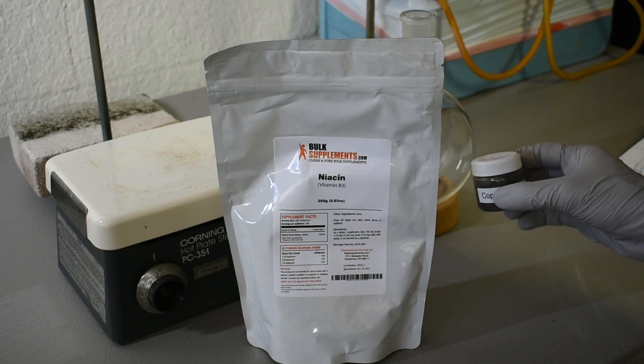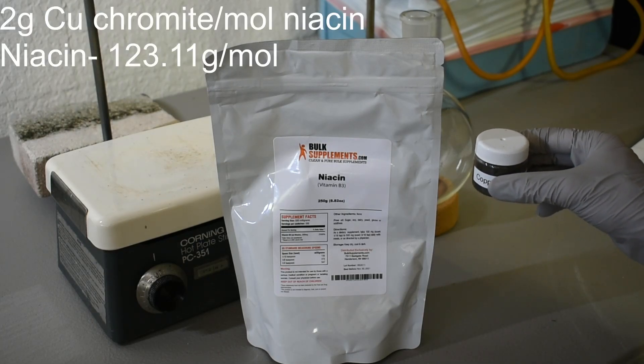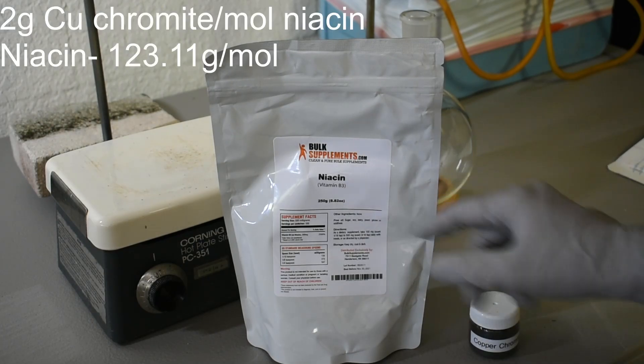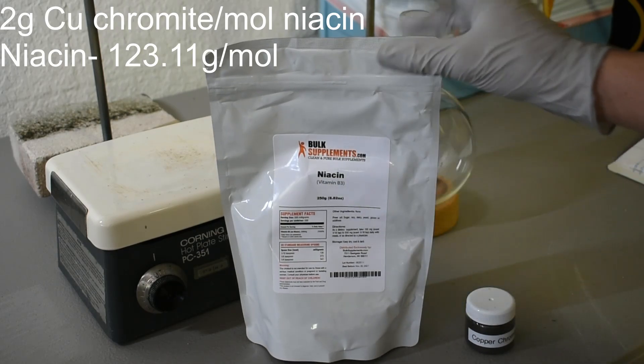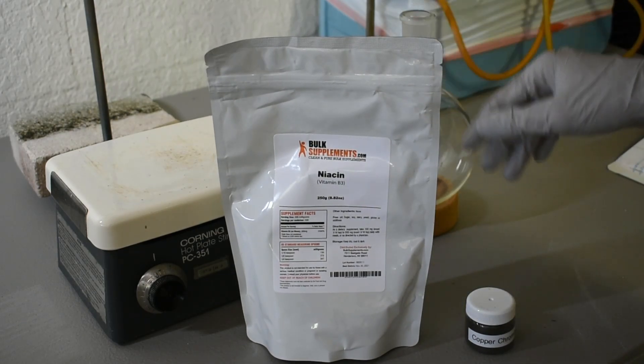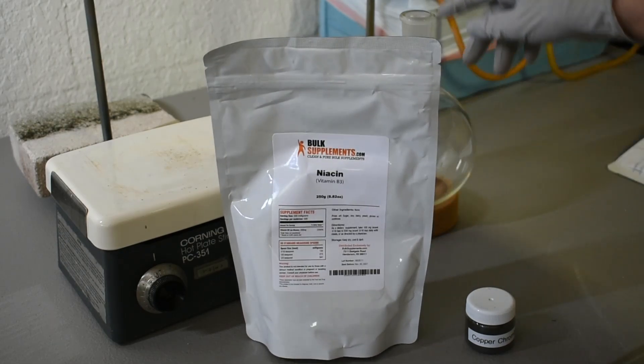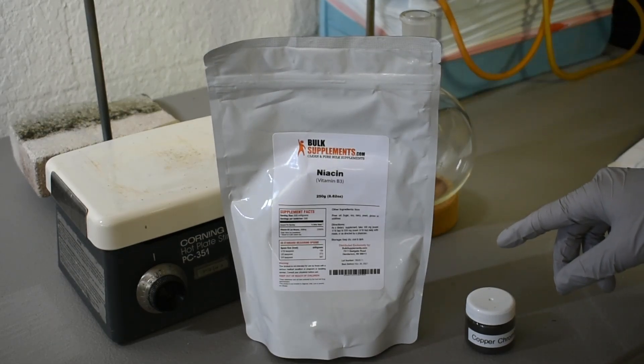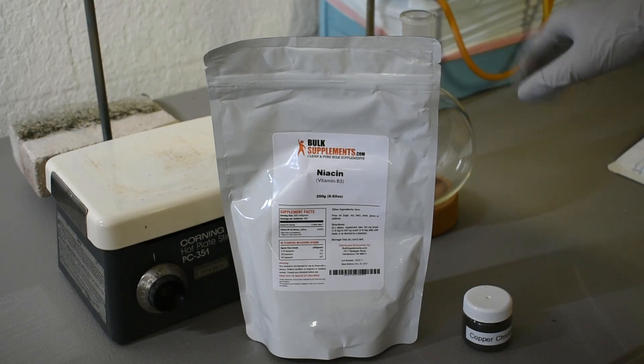You need approximately 2 grams of copper chromite per mole of niacin for the decarboxylation. I'm going to load the niacin into the flask, then put the copper chromite in there, shake it around, and we'll set up for distillation.